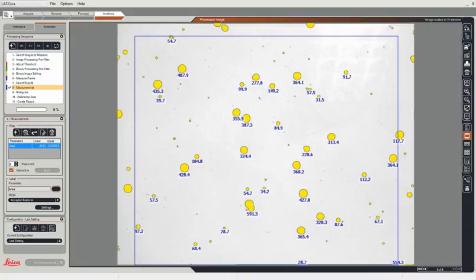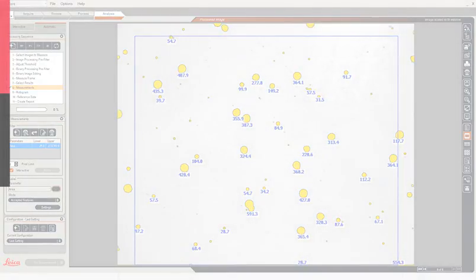In the next example, we will show how to extend this to a more complicated image than the one we have here.